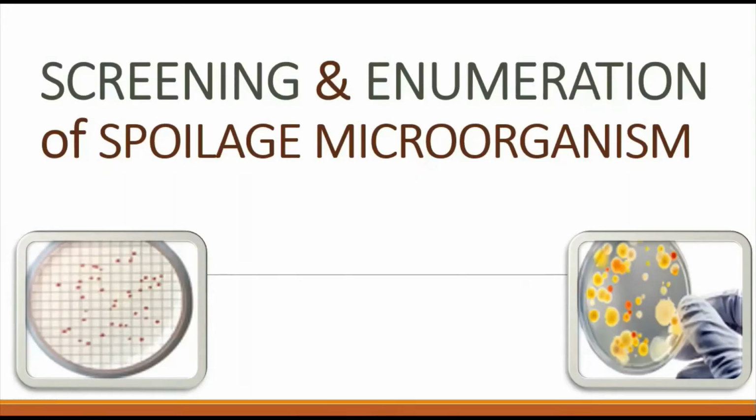Hi everyone. Now we are going to discuss a topic called screening and enumeration of microorganisms. As a part of daily routine, the laboratory microbiologist often has to determine the number of bacteria in a given sample as well as having to compare the amount of bacterial growth under various conditions.